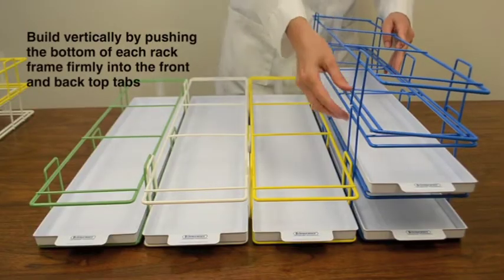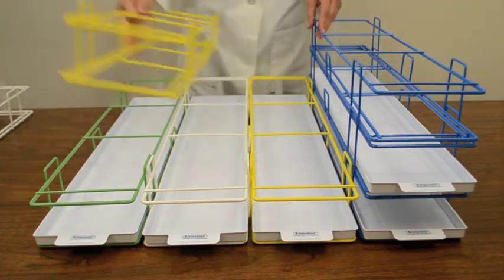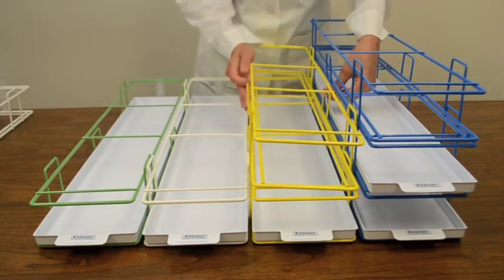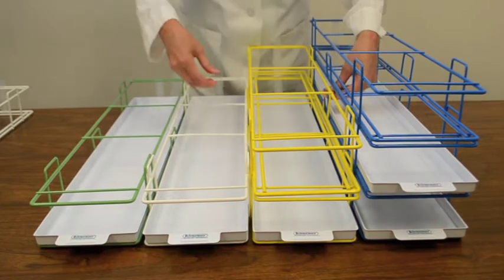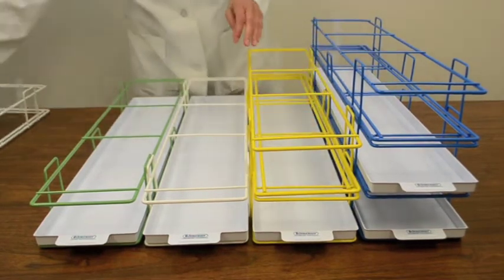To build vertically, work on a slight angle and push the bottom of the upper rack frame so that the front and back tab areas press into the front and back tabs of the lower rack frame. This is a friction fit and very secure.